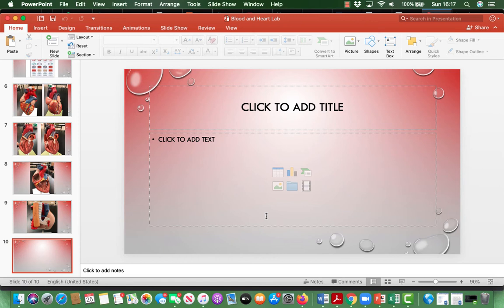That covers the structures of the heart you need to know. Now I'm going to show you this on a beef heart. I'll also post a dissection of a beef heart because unfortunately I tried for over a month to get a beef heart — they all came butterflied from the butcher, even though they were told they wouldn't be. So I'll show you what I can on this beef heart and also post another dissection so you can see the structures better.